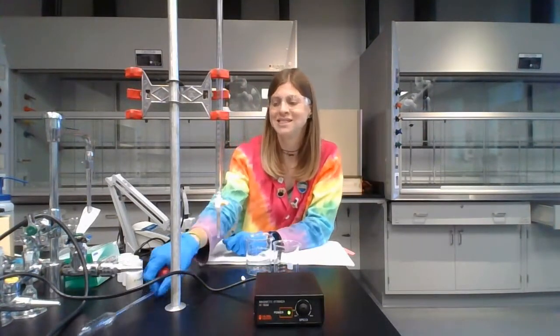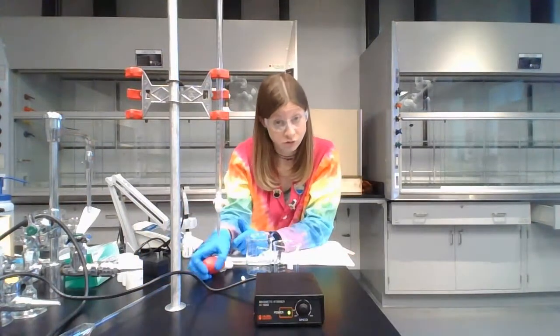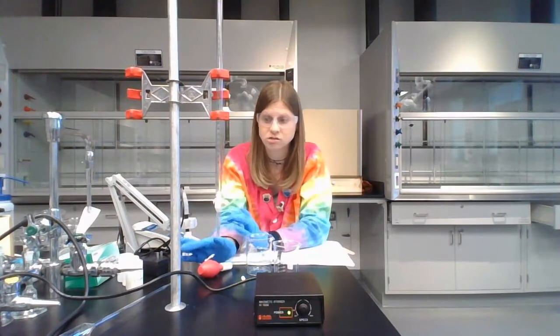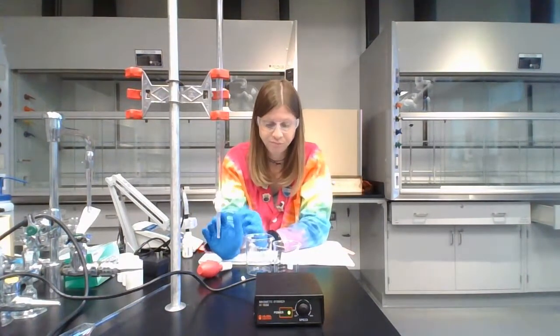We are not adding any deionized water to this. It's already a solution. It's already been mixed. So we don't have to degas any water, boil any water. It's transfer the liquid into the beaker.